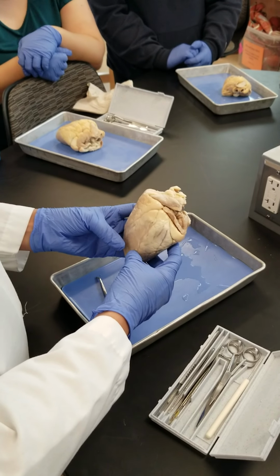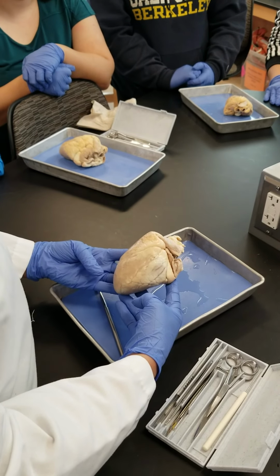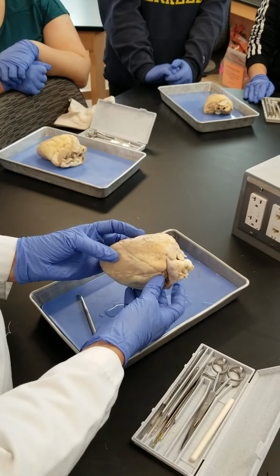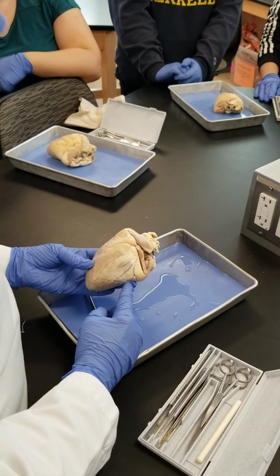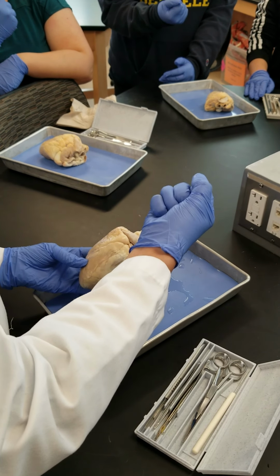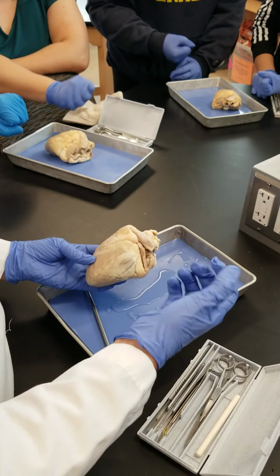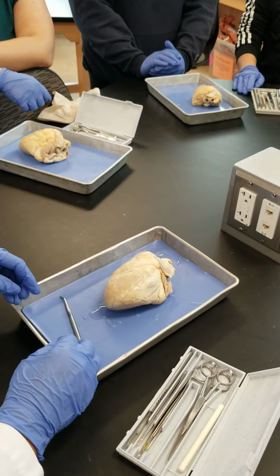So, ready? Yep. So here, this is a heart. Look at that. Isn't it beautiful? Yes. What's the size of your heart? As we said, closed fist, right? Everybody's closed fist. Some is smaller, some larger. That's the same for your body too, right? So that's not a big deal. It's doing the job for that body, right?